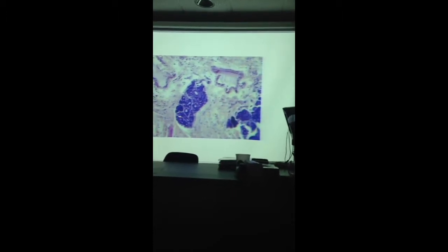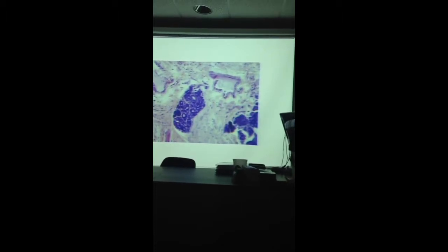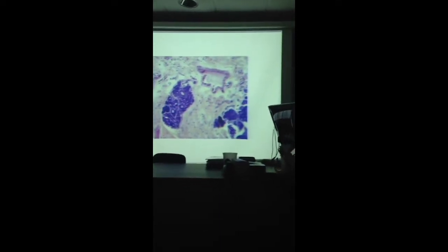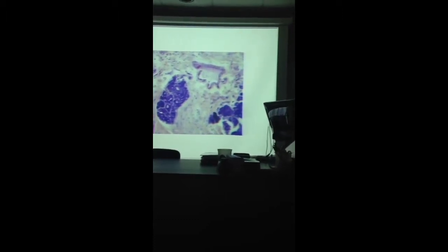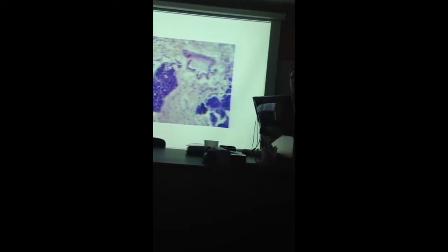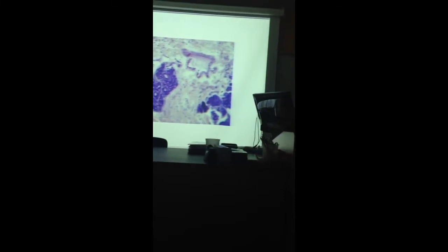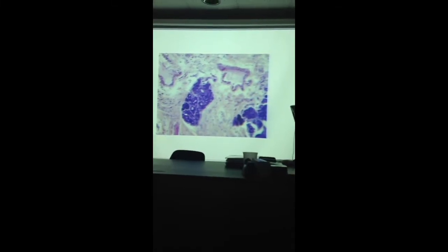These are serous cells. Remember, the salivary glands are a combination of two general types of cells, serous cells and mucous cells. And usually the darker stained ones are the serous cells. And they produce what kind of secretions? Thin, watery secretions high in what? Amylase. And that's a digestive enzyme. What does it do? It breaks down complex carbohydrates like starch, in this case into maltose, which is a disaccharide, a double sugar. So carbohydrate digestion actually begins in the mouth because of the salivary amylase in the secretions of these serous cells.